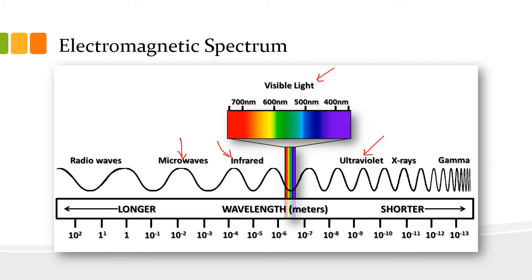It absorbs light, particularly around 420 nanometers. So down in this range, 520 and 620. Those are 3 wavelengths that we will be looking at. We are also going to look at 280 nanometers, because there is significant absorbance of ultraviolet light at 280 nanometers, significant absorbance by wine.